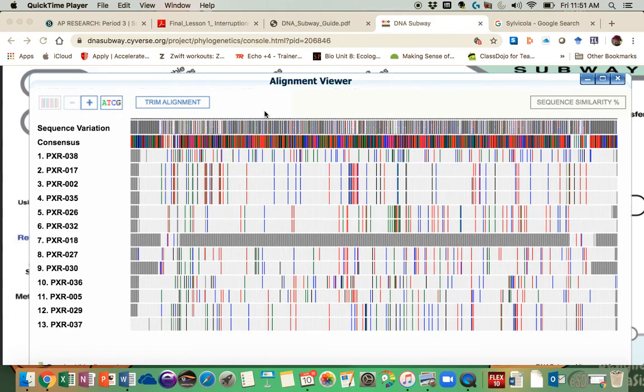Hi, Julie. Hi, Sarah. I figured I'd pop into the DNA subway blue line to give you a little tutorial about what's going on here. So this is the alignment viewer, right?